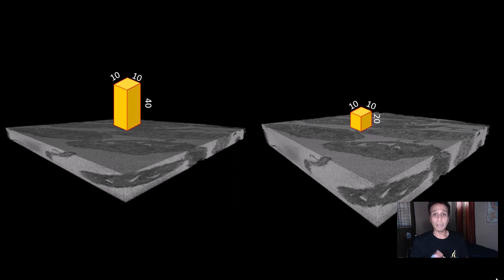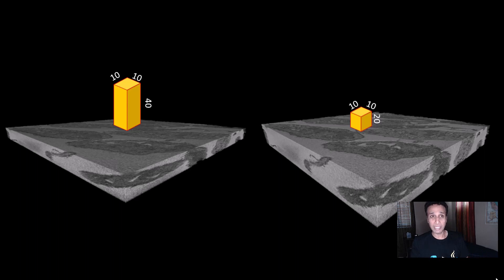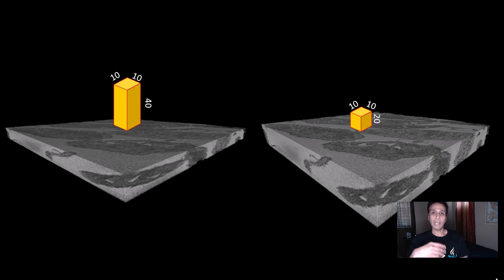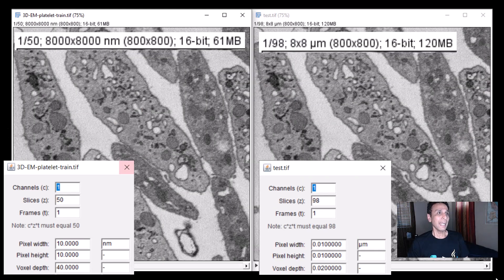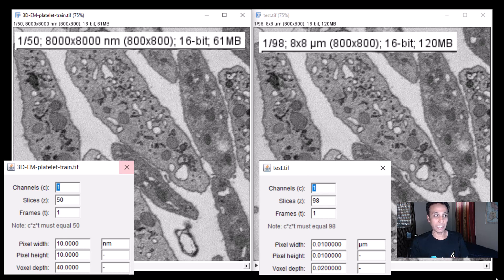For a visual look: on the left-hand side you have a larger voxel size with fewer slices, making it thinner. On the right-hand side I took that 40 and added a slice between alternate slices, so the voxel size is now 10 by 10 by 20. Instead of 50 slices in z you end up with 98 or 100 in z. Here again is a screenshot of the same dataset — raw data on the left, resampled data on the right, from 10 by 10 by 40 to 10 by 10 by 20 nanometers.